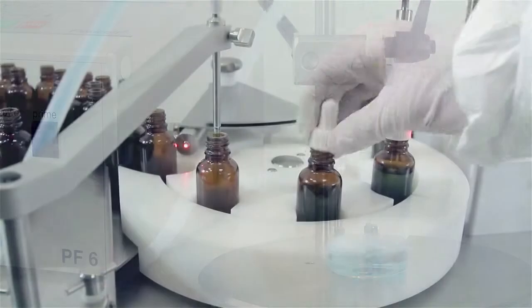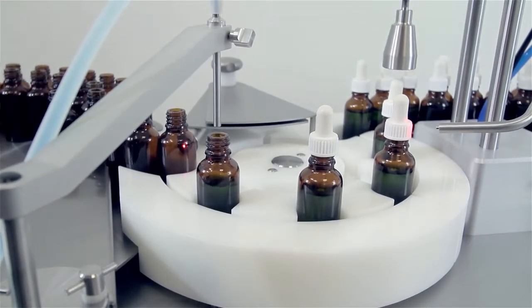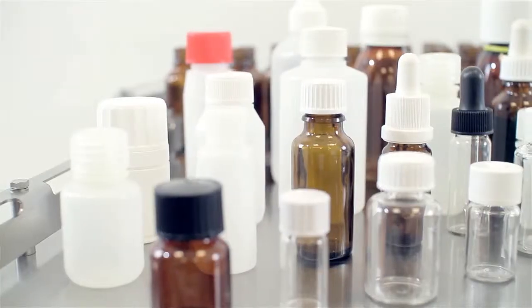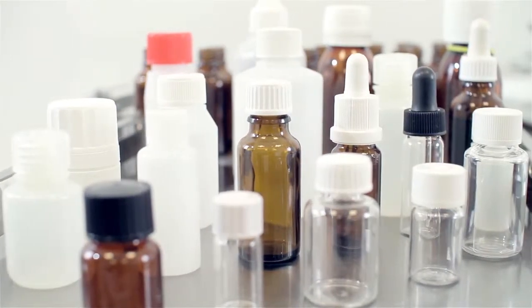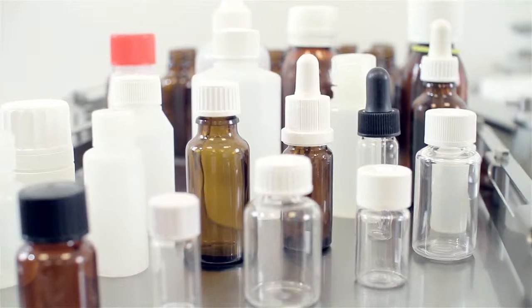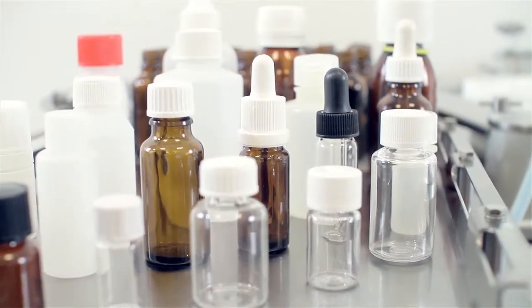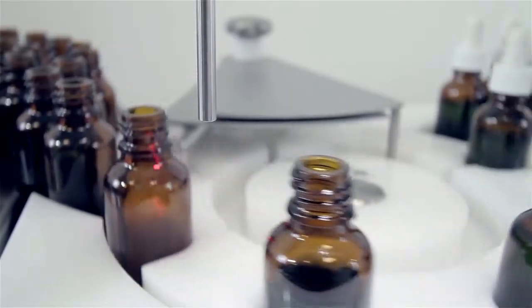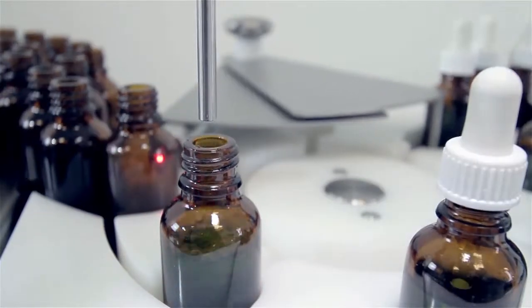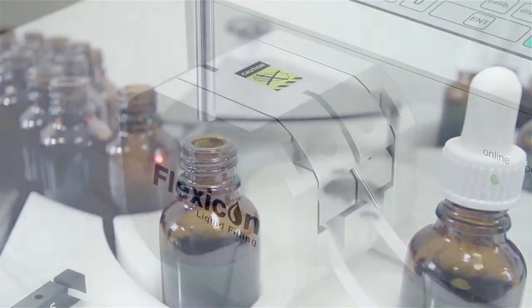The PF6 is able to fill volumes from less than 0.2 milliliters to more than 250 milliliters and a filling accuracy of plus or minus 0.5% is achievable for most volumes. This unique and consistent filling accuracy prevents costly overfilling and contributes to an excellent return on your investment.